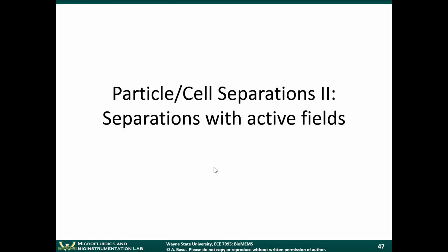That's one of the reasons why these techniques that we showed have been so popular. They're very simple to do. You just have to flow the particle suspension through a specific channel and you get these very cool and interesting sorting effects. But there's also a lot you can do with active fields.